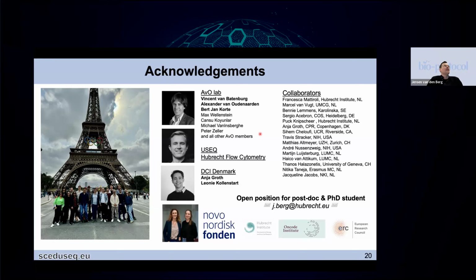So both centromeres and subtelomeric regions are replicating late, at least in these RPE cells.